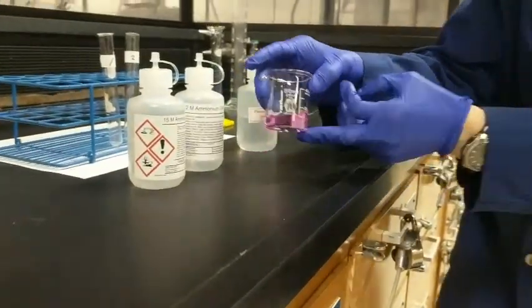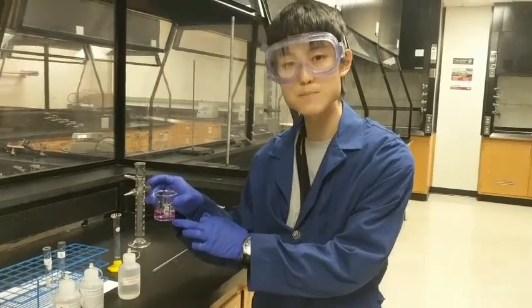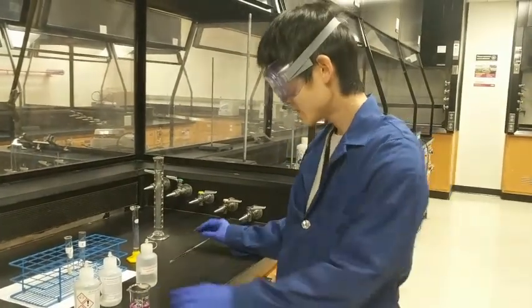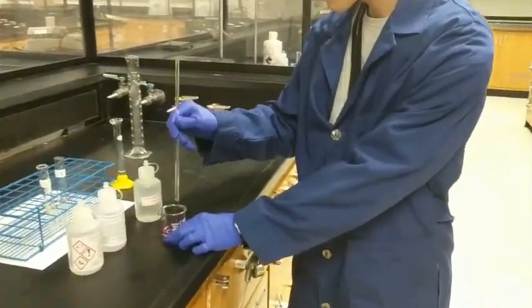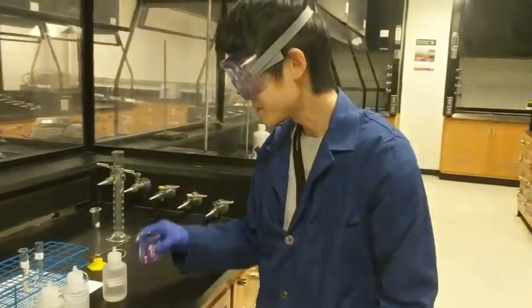The phenolphthalein indicator shows a red color when the solution is basic, and it's colorless when the solution is acidic. So we're just going to mix it together and then split it into 2 clean test tubes.